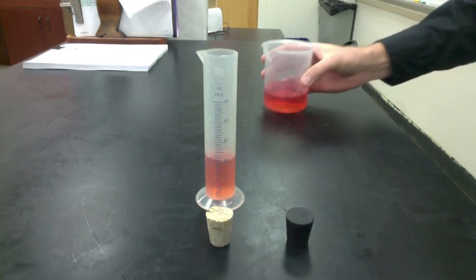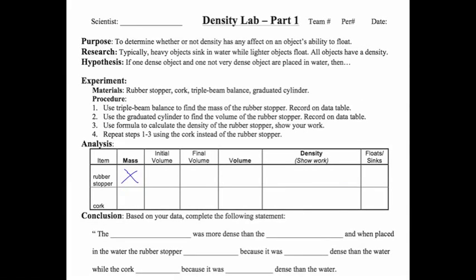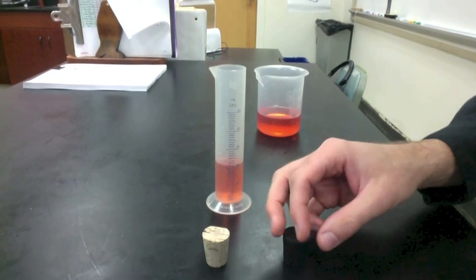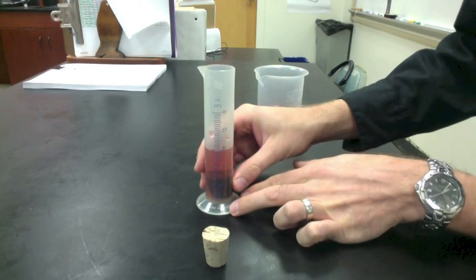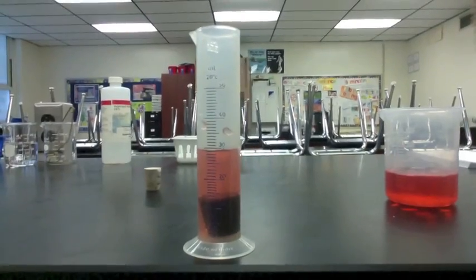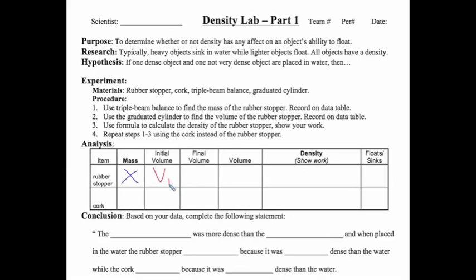Now it's time to take our first volume. Get eye level and be as accurate as you can be. The first volume goes under the column for first volume on your data table. Carefully slide the object in so the water level rises — don't splash any water out of the graduated cylinder. Now we take our second volume. Put this volume on your data table. To find the volume of the object, we take the second volume and subtract the first volume.